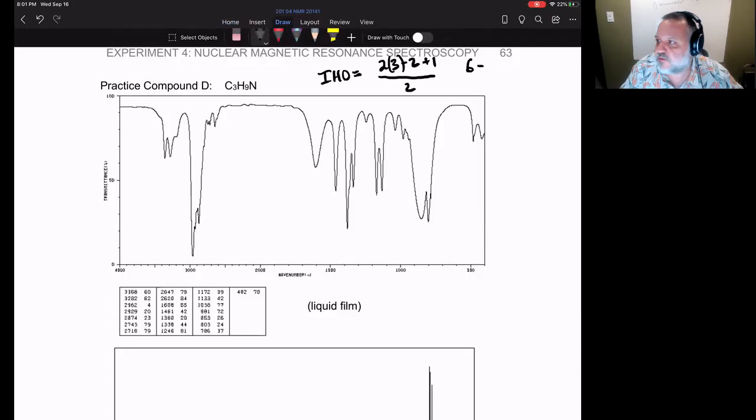And oh, I didn't count the number of hydrogens. How many hydrogens are there? I've got to do that too. So let's redo this. Sorry, let's redo this. Okay.